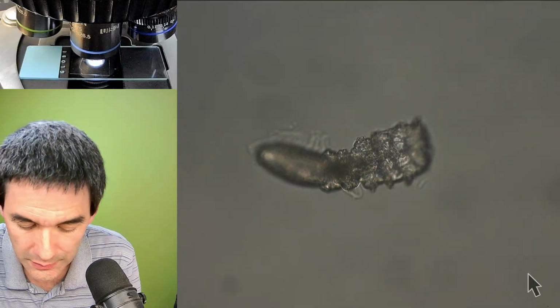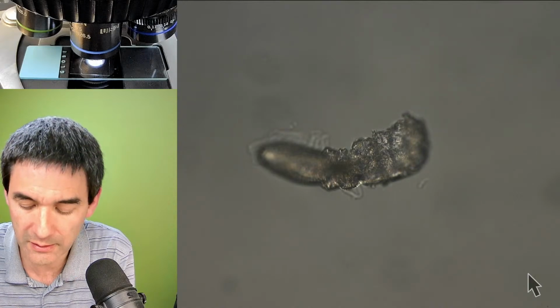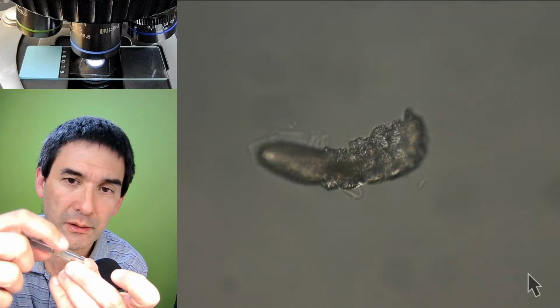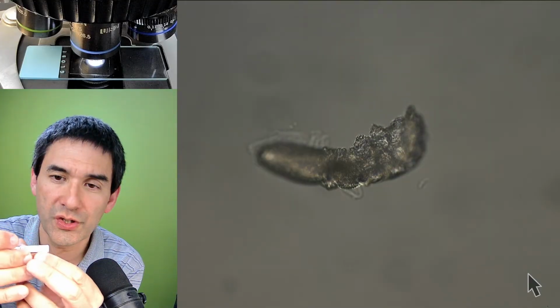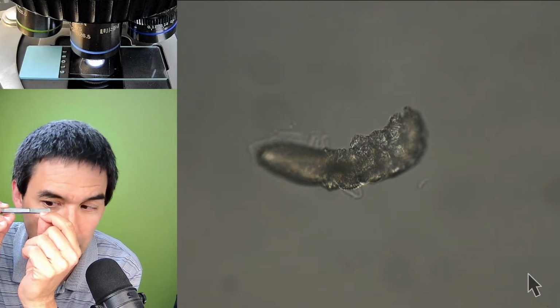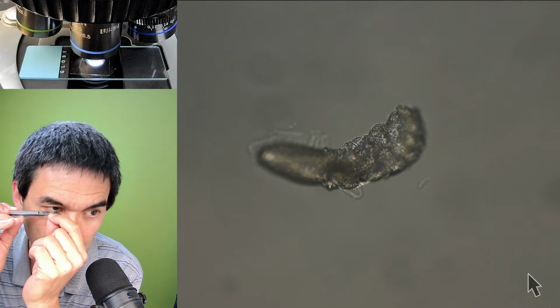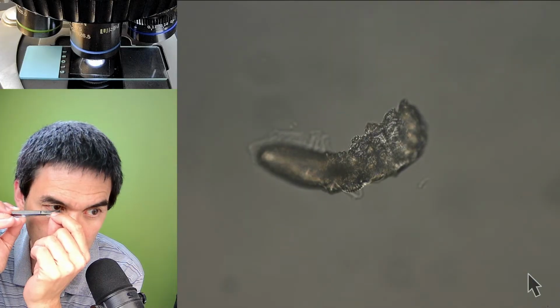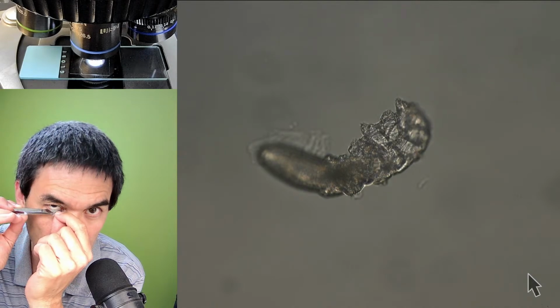I don't know. Usually it's easier in front of the mirror. You take some tape, and you wrap it around here with the sticky side outwards. Then I'm going to touch my eyelashes, hoping to be able to collect any that might have been squeezed out.